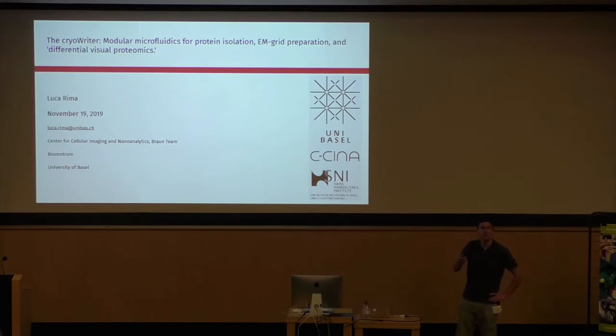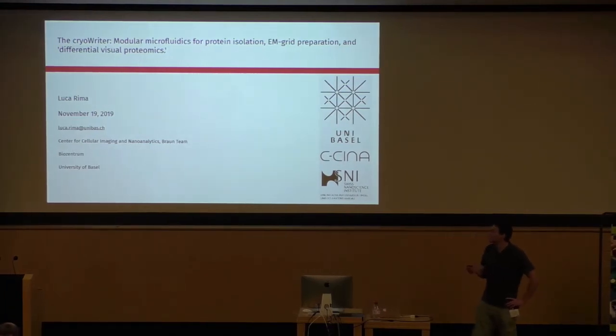So I got the opportunity to talk to you about our microfluidic sample preparation device we call the cryoWriter. So in the next few minutes I will try to give you a rough idea what is the cryoWriter and what it is capable of.